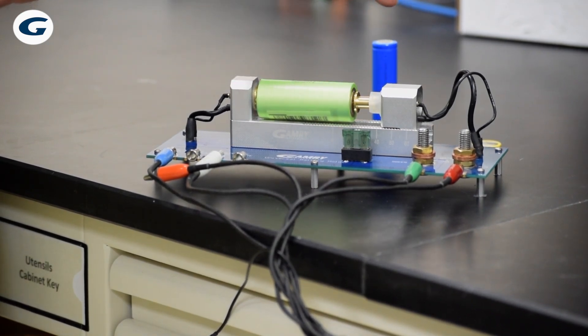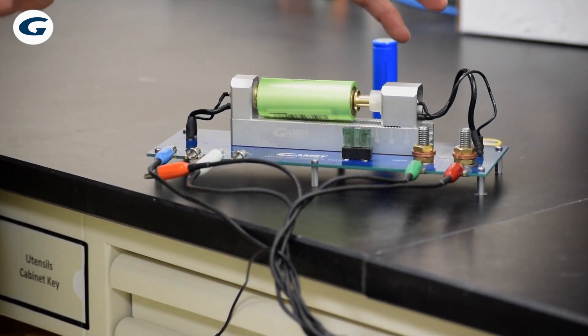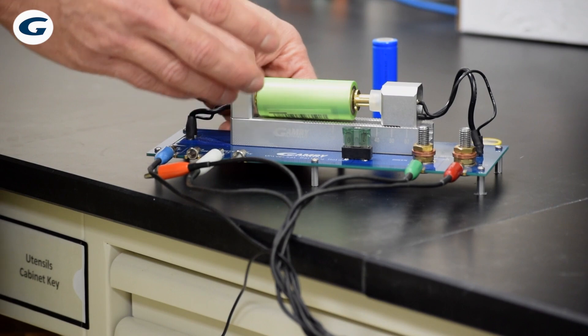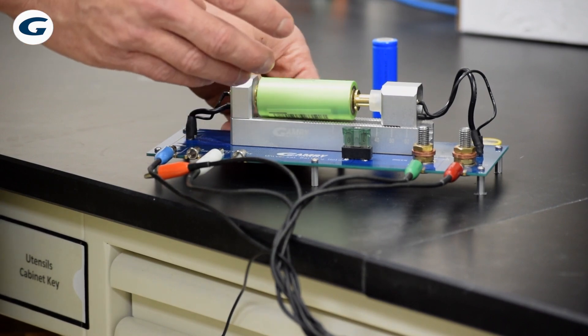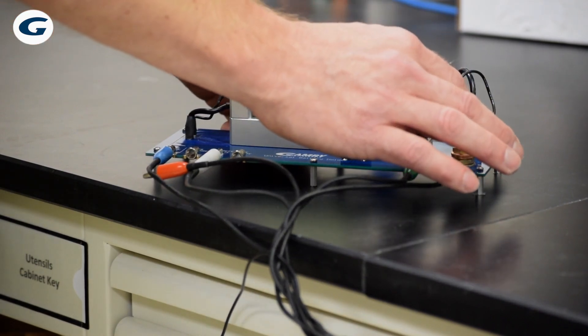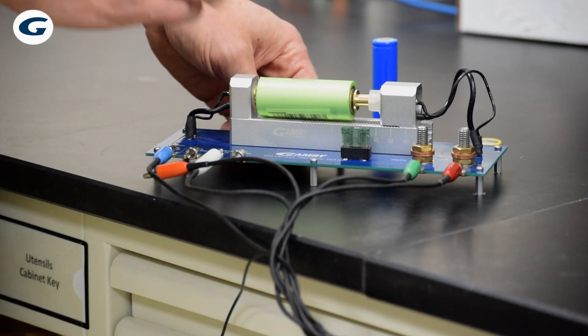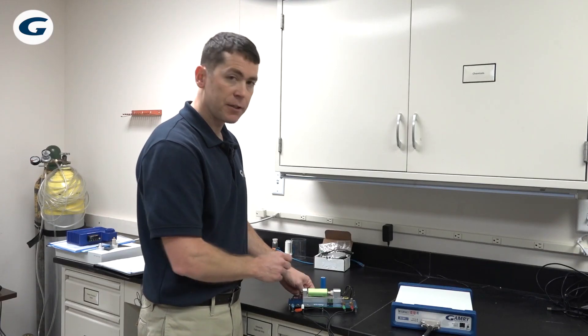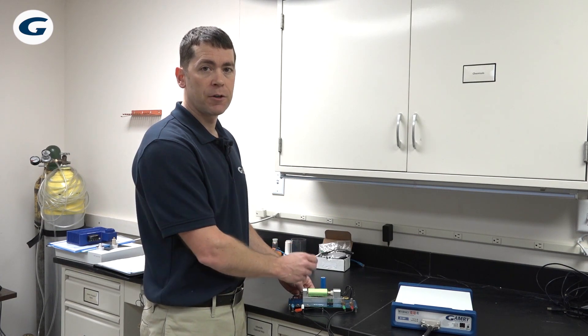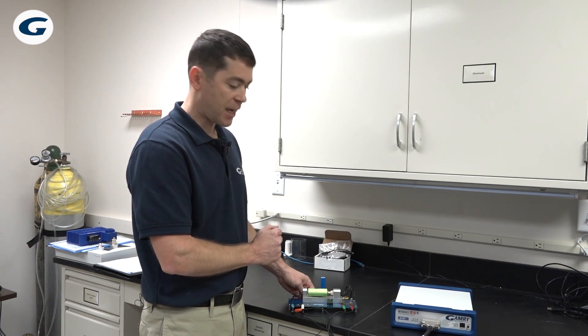This Universal Battery Holder is a four terminal battery holder so you have separate sense and current carrying connections. It can hook up to any Gammary Potentiostat including the reference 30k booster so there's large connections that you can run up to 30 amps through this Universal Battery Holder. It's fuse protected with a 35 amp automotive fuse. It's easy to replace if something should happen.